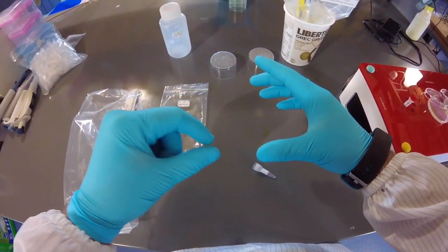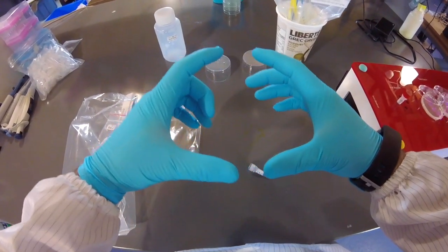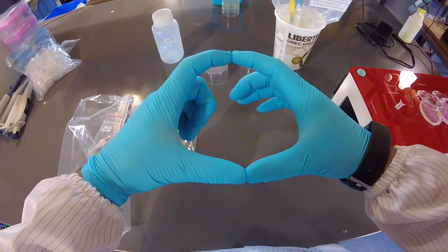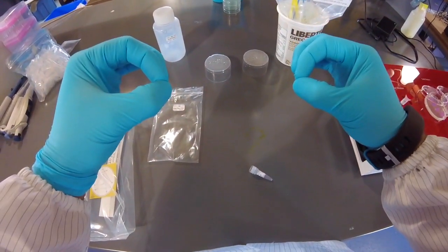And then the third piece is called the origin of replication. And you might have learned about this. This is the point where the cell will recognize the DNA plasmid and actually copy it to create 2 DNA plasmids, all right?